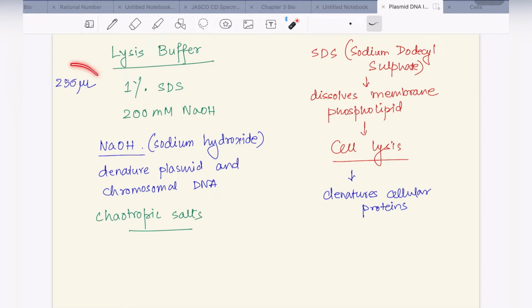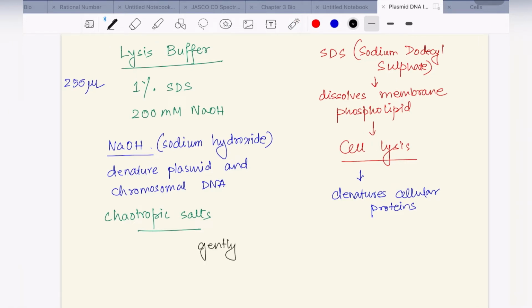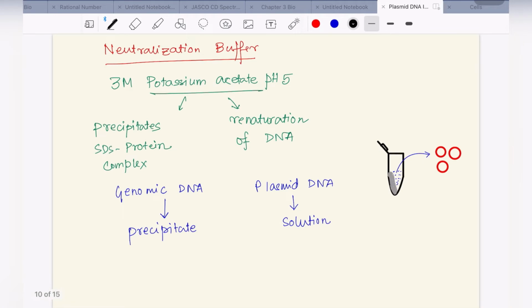Now, 250 microliters each of lysis buffer is added in the tubes, and then the tubes are inverted gently. We invert the tubes and mix 5 to 6 times, thoroughly. After lysis comes the neutralization step. So lysis is done in alkaline condition. Now we need to neutralize this pH, and we use potassium acetate for that. 3 molar potassium acetate, pH 5, is used for this purpose.